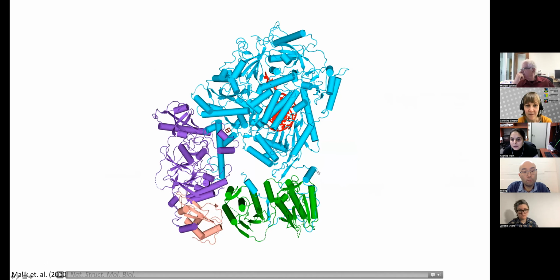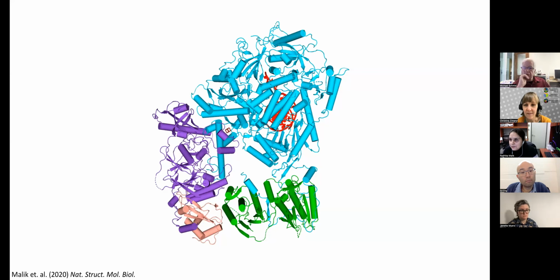That is actually regions around this RIR domain. It's around 300 amino acids which are missing in the Rev3 subunit. And we think that there are other factors in the TLS machinery which have to bind for us to be able to see those regions of the RIR domain. But in terms of processing, this was a pretty uniform data set, and there wasn't much heterogeneity that we had to sort out to get our ab initio models.